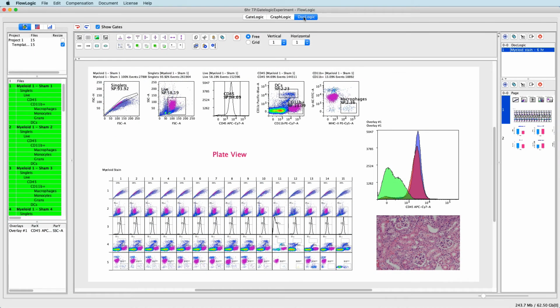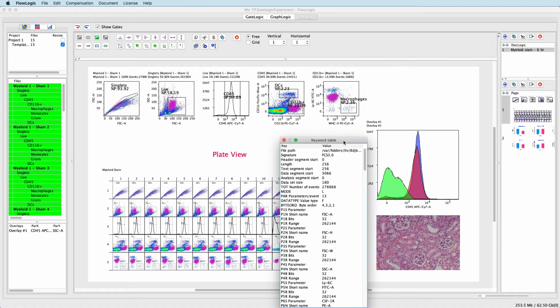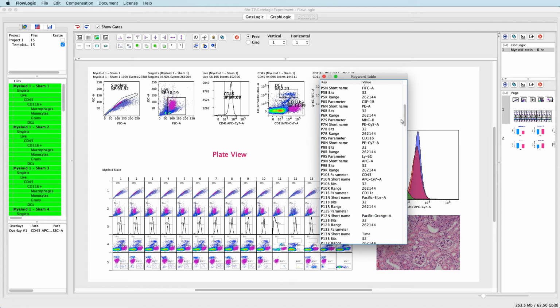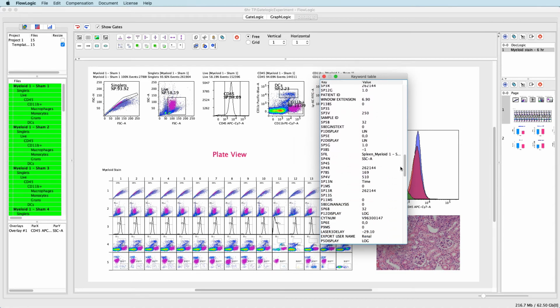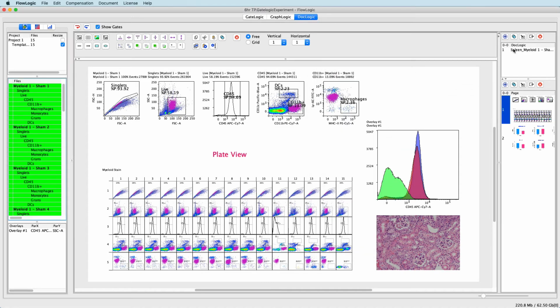It is also possible to name documents using keywords in the file metadata. This may be useful if you'd like the file name from the first file in the list to be what names your document as part of your template. To do this, select the document, then select the file containing the metadata and drag it on top. Then from the list of metadata, choose the keyword or keywords that you'd like as part of the title, then click and drag onto the document name.